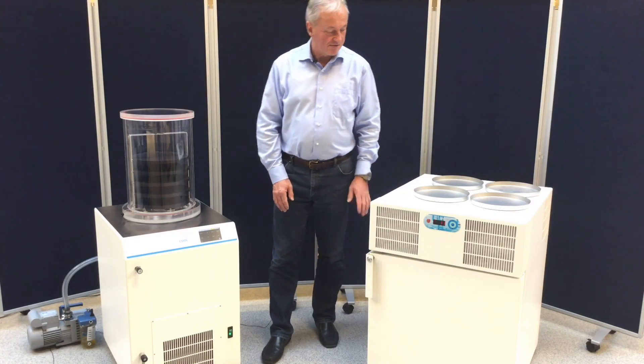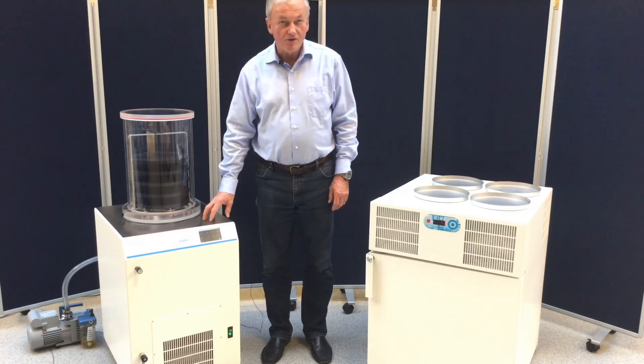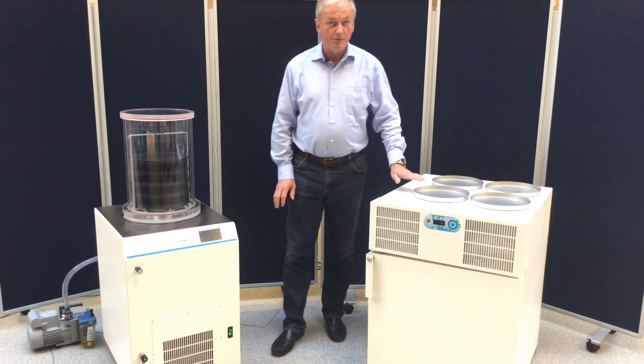Hello, I'm Jesper from Laberdin. Today we will speak about freeze drying, but also what is most important: how to do a proper pre-freezing.